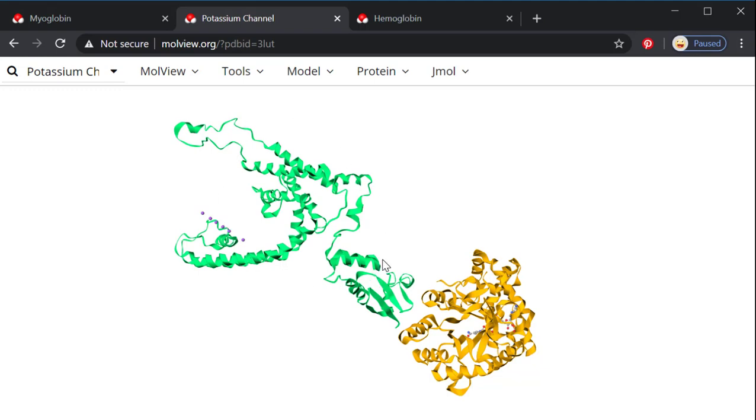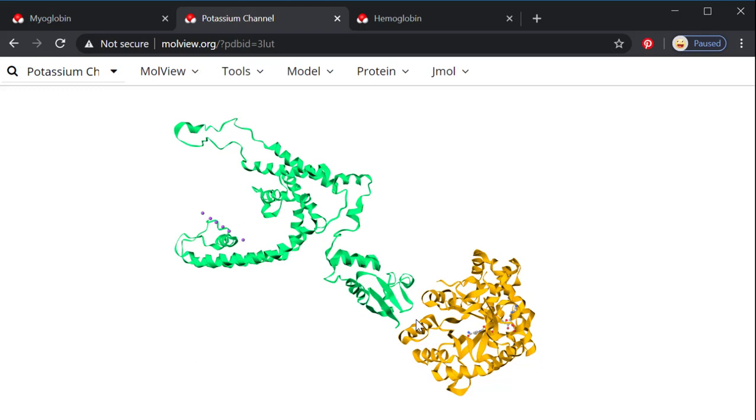The green would unravel, it's not bound to the yellow, it's just intermolecular forces holding them together. And then yellow would be a separate polypeptide. So it would be quaternary structure that holds these or the whole thing together would be quaternary structure. And it would be held together by some of those attractions that hold quaternary structures together.